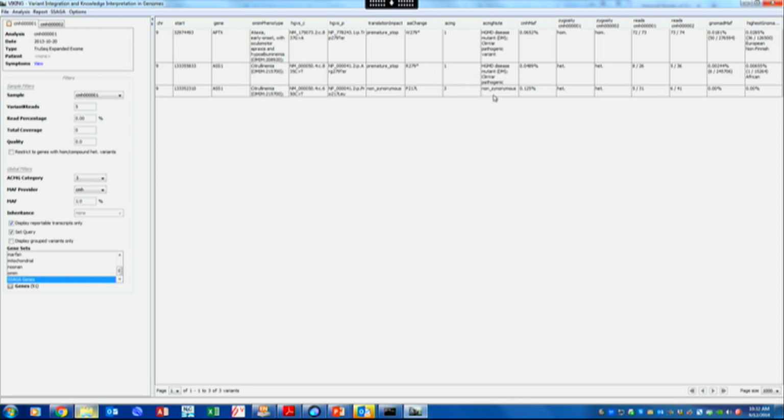This gene, I don't know. This is citrullinemia. This is a stop mutation actually, but they don't have this. So that can be very straightforward. If you take off your SAGA filter, you're going to have 150 variants to sort through. Maybe not if you're insisting that both sisters have the same variant, but it's not that often that we're doing something other than a parent-child trio. It's not that often we're getting multiple siblings. Okay, so let's do a more complicated one.